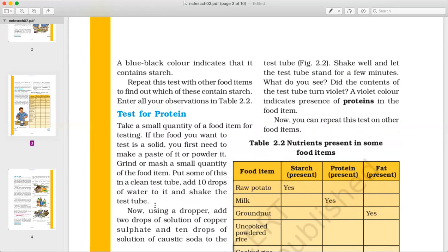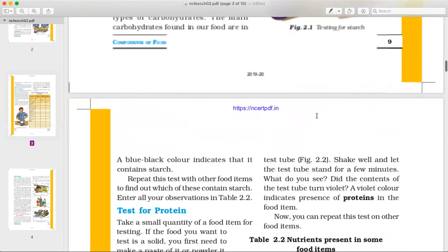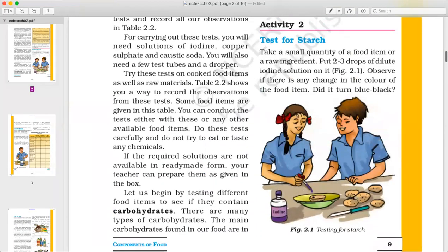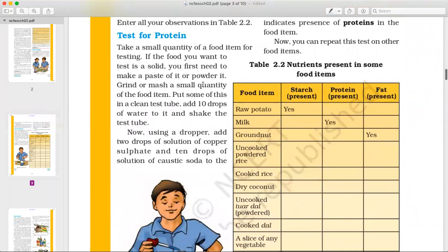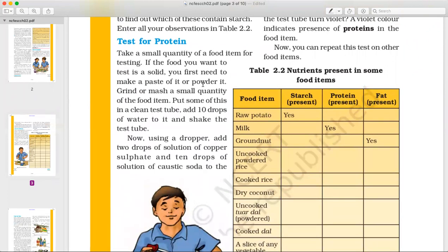Add 10 drops of water to the test tube and shake it. Then, using a dropper, add 2 drops of copper sulfate solution. After that, add 10 drops of solution of caustic soda to it.